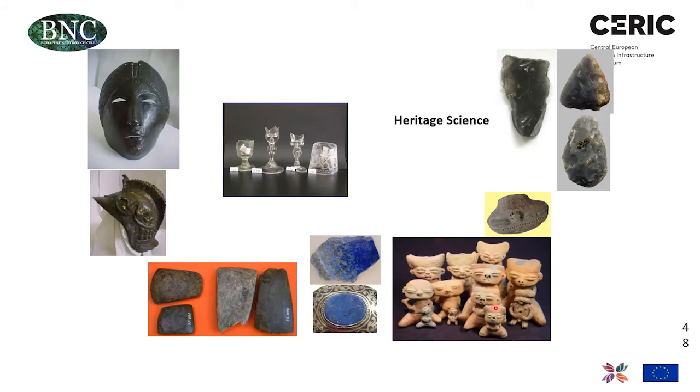And if we check the composition of the ceramics and correlate it with the local raw materials available like soil, we can identify differences, and based on this we could say that a certain fraction of the potteries were made on the island and the other on the mainland. And of course there was a set where it was not clear and it was not easy to distinguish.